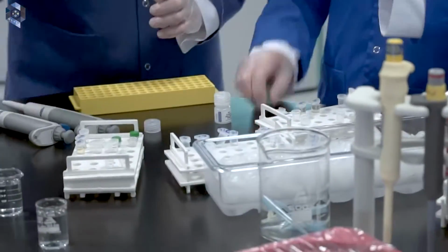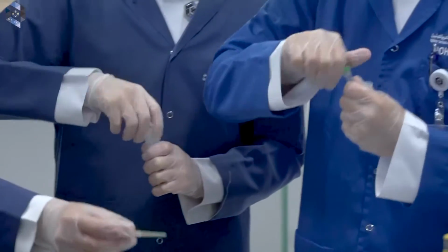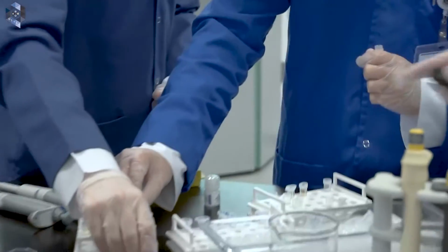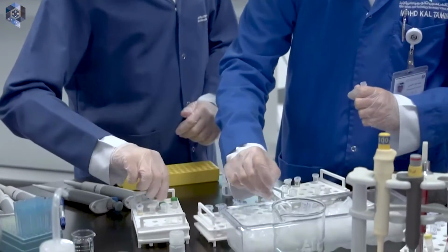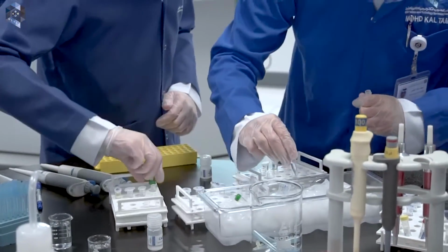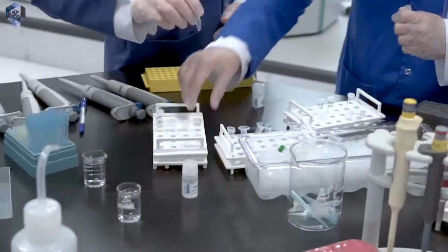Now, the ready tubes, I want you to place them on ice. On ice here. Place the ready tubes on ice, the ones to which you added the green tubes. Now place them on ice. Okay. Also there are two other centrifuge tubes here. Add to them please the calcium chloride.